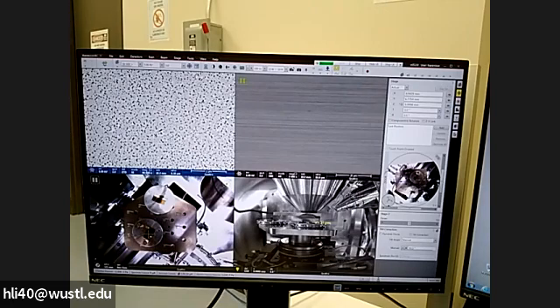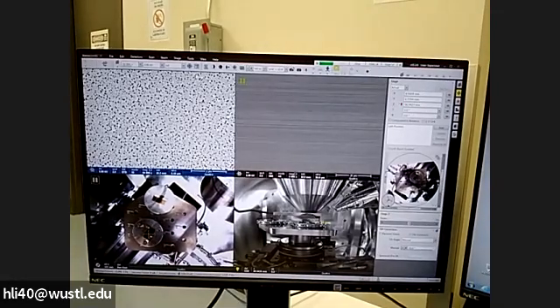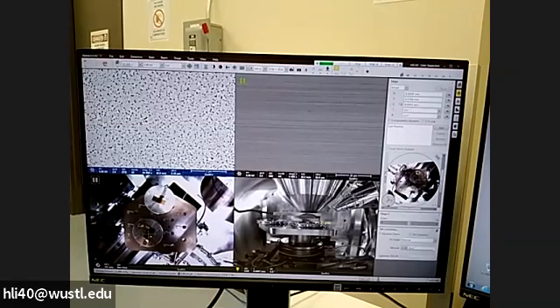The next thing is, you see the working distance drifted a little bit again. What we can do is right click on this linking button and select unlink. That will remove the previous relationship, because that is from some previous sample. Your sample may have a different height, or the holder has a different height. If you want to keep this working distance at 10, you unlink it and link it again. After making sure it's focused, we link again. We just simply type 10 there, then you enter. All right, so we still keep it at 10 and then you focus.